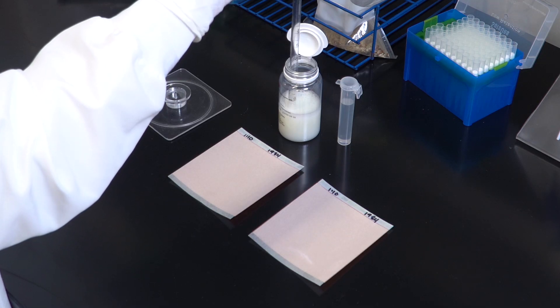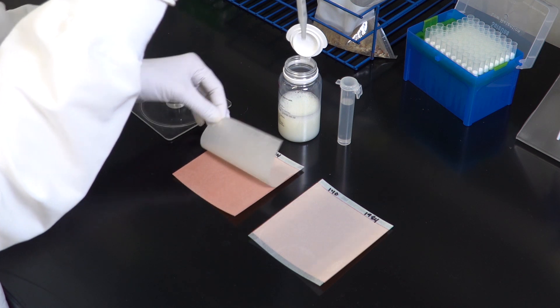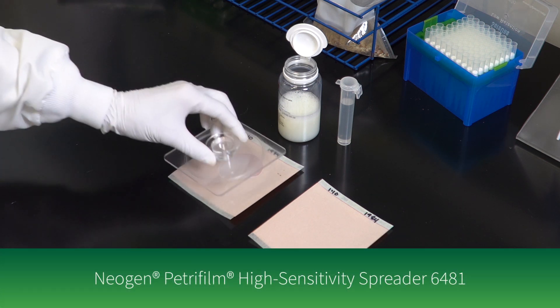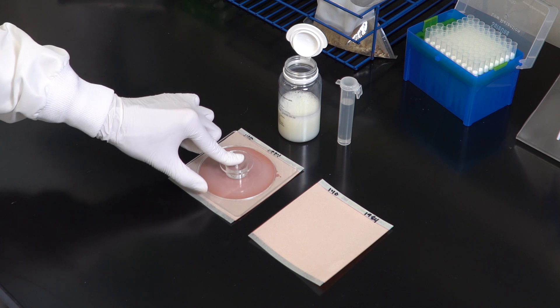To inoculate, lift the top film and dispense five milliliters of the prepared sample onto the center of the bottom film. Roll down the top film and place the Neogen Petri Foam large square spreader over the sample. Press gently to distribute the sample evenly.